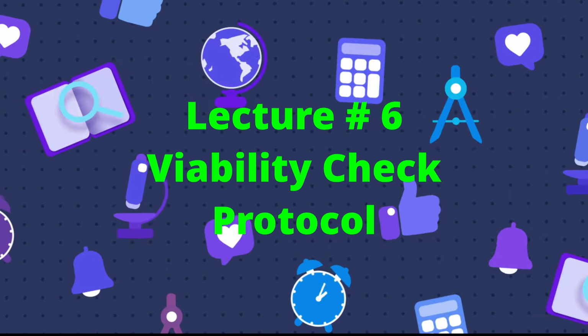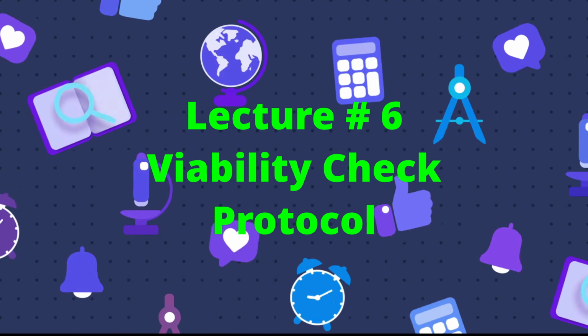Today's lecture is about how you can create a viability check protocol.